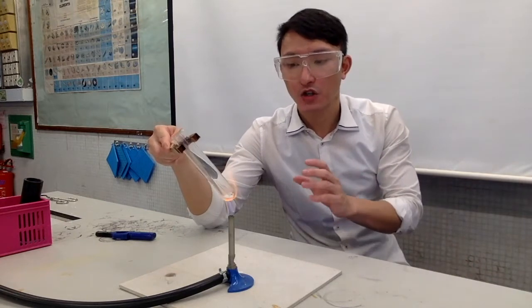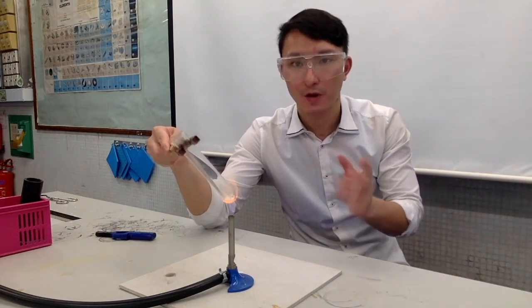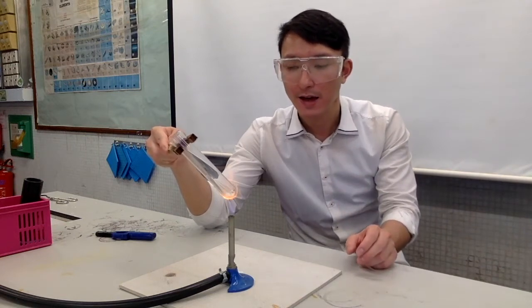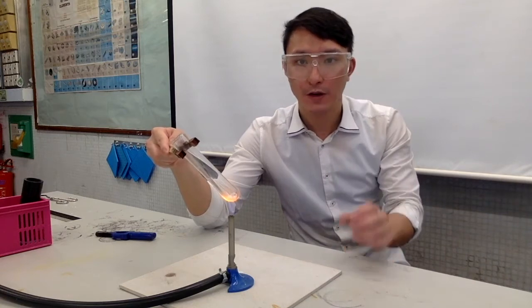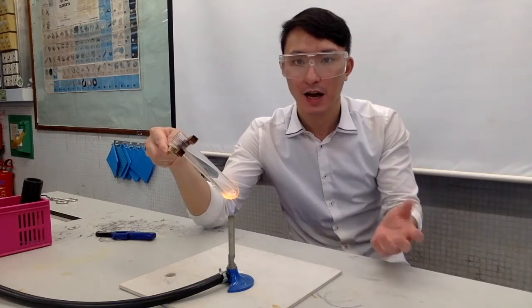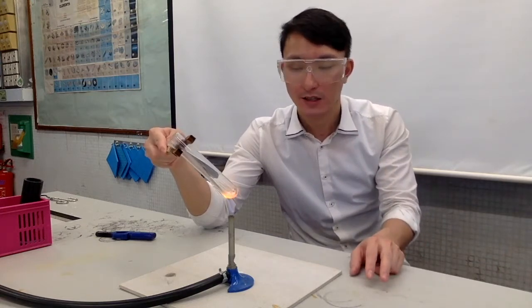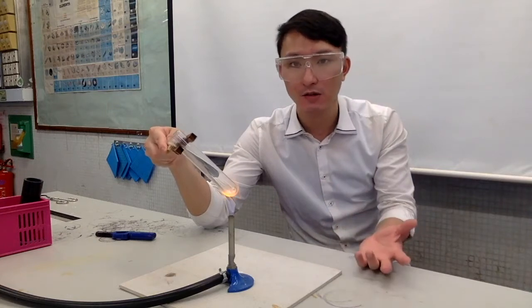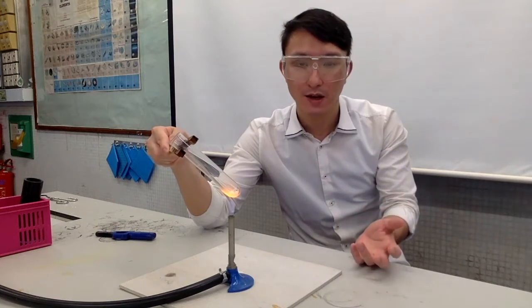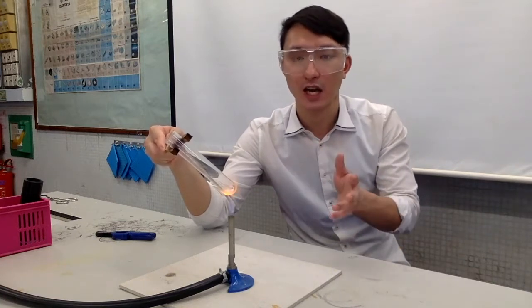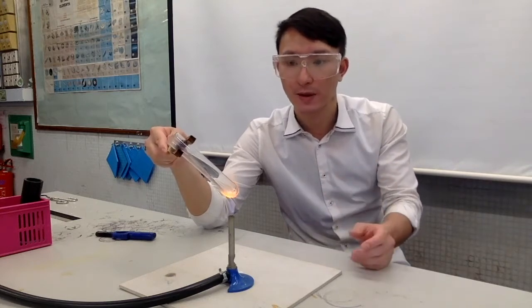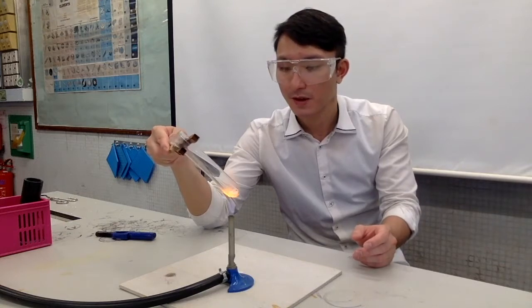What we are doing here is thermal decomposition of calcium carbonate. You would expect the products to be calcium oxide — also known as quicklime — and carbon dioxide. However, calcium oxide is a white solid and calcium carbonate is also a white solid, so you don't really see any color change. Carbon dioxide is a colorless gas, so you won't expect to see any observable change.